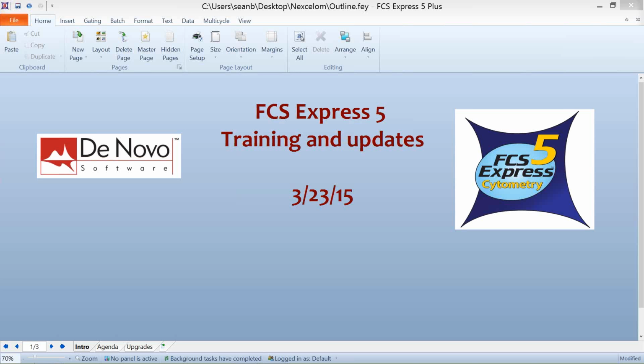I wanted to outline some of the new features, show them in some of the Nexcelom templates that you already have developed, just to get an idea of how some of these features can work their way into the existing layouts that you have, and then also give some essentially basic training for people who may not know how to actually work with FCS Express to create layouts, to create templates, to build and plan templates, to show you how that is done.